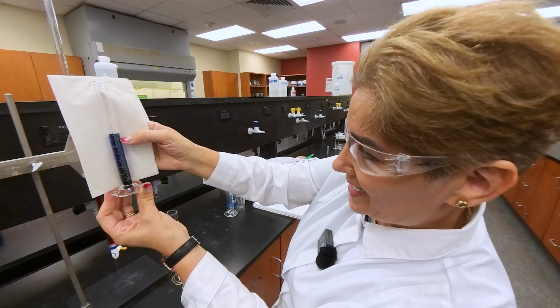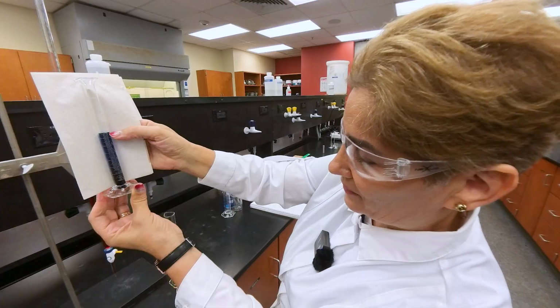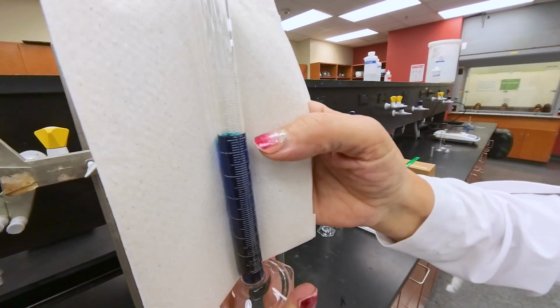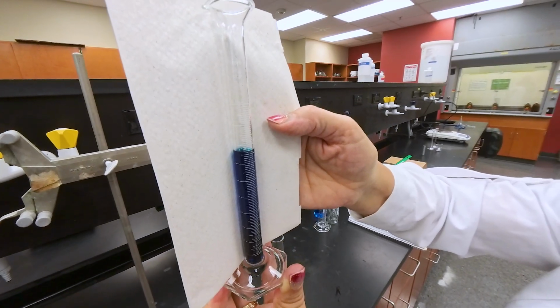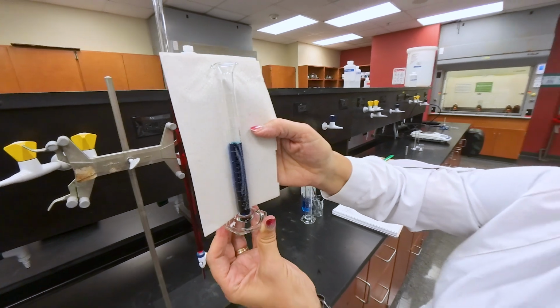So if I'm counting up, the level of the liquid would be between 7. Let me look at it closely. It's between 7.5 and 7.6, and I'm looking at the meniscus.